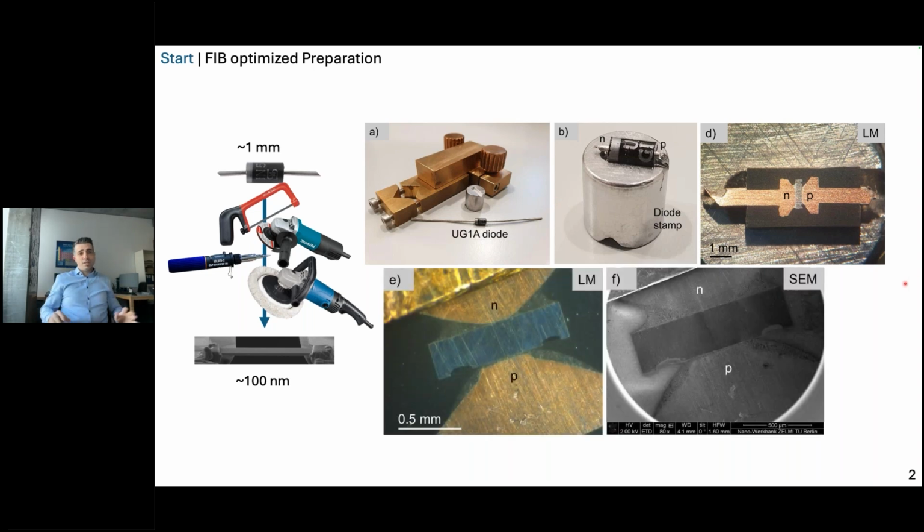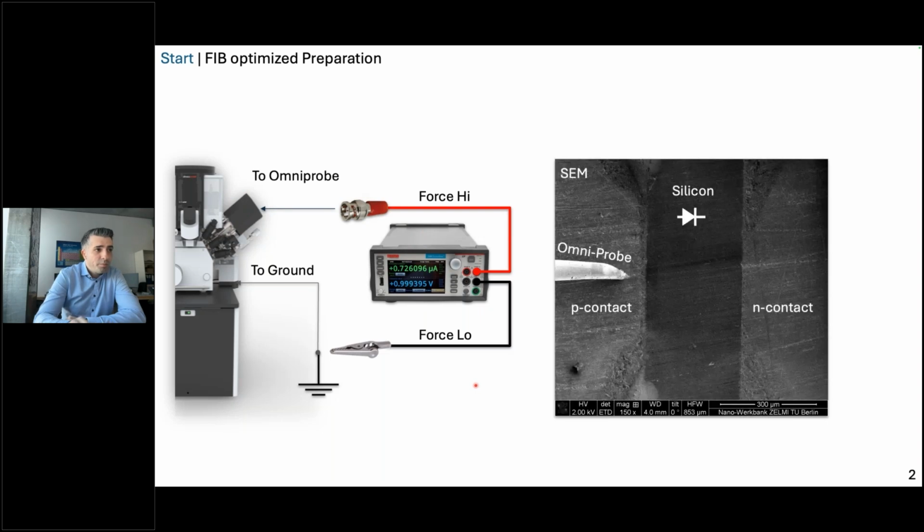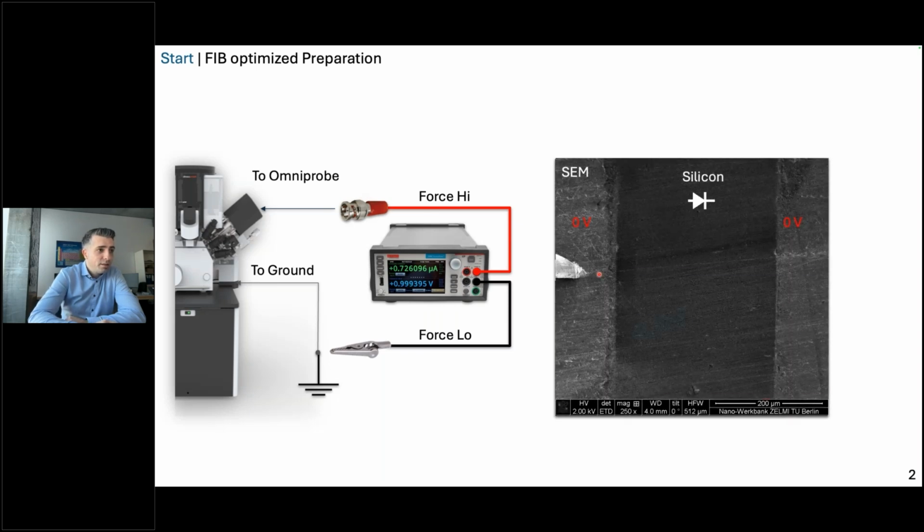Then I faced my first problem without even being close to the TEM. These PN junctions in silicon are not very visible. This is actually the reason we need special techniques to make them visible in the TEM. But out of the box, the question was, where is the PN junction? There is actually a rather easy way to find out. If you have a FIB machine, you can connect a Keithley source meter to your micromanipulator, and by putting the micromanipulator to one side of the PN junction and applying a bias, you can really easily make them visible in your secondary electron detector. This is called voltage contrast microscopy, and it's based on surface charging, and there's a lot of theory behind it.